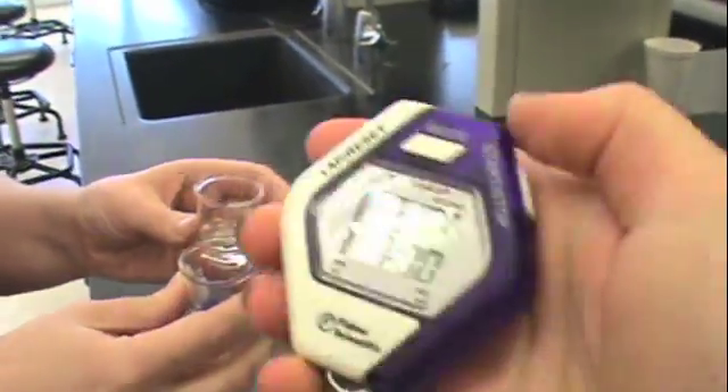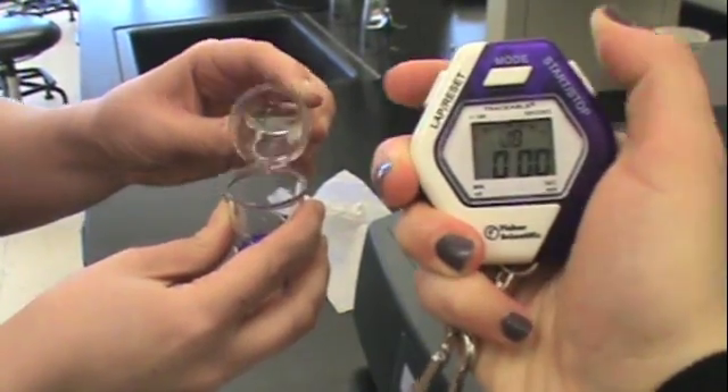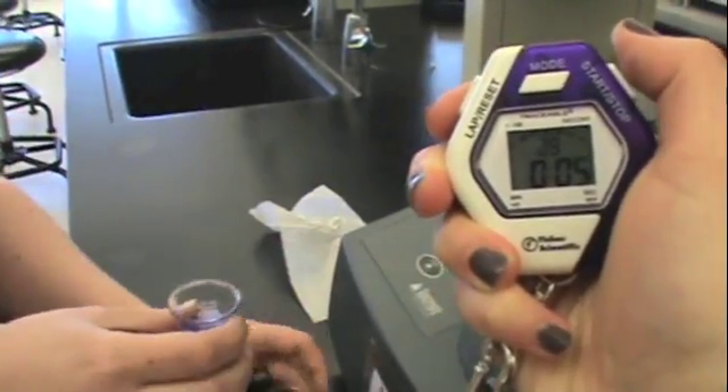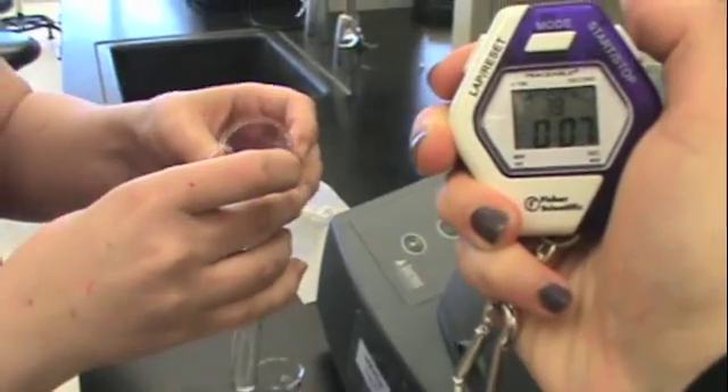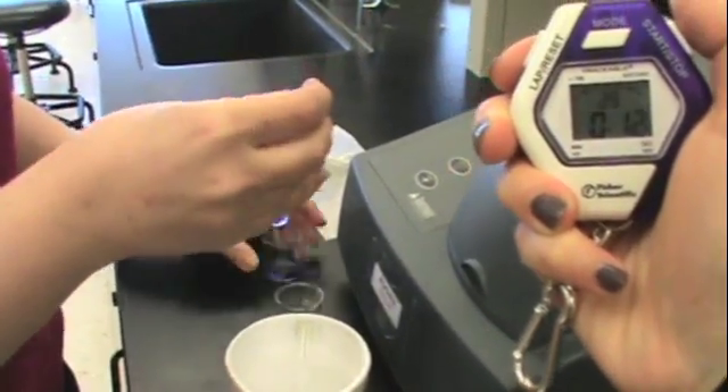Now that you've seen how the stopwatch works, let's show you an experiment. We're going to start the stopwatch right when the reagents are mixed. We'll mix thoroughly, then add the reagents to the cuvette and place the cuvette immediately into the spectrometer.